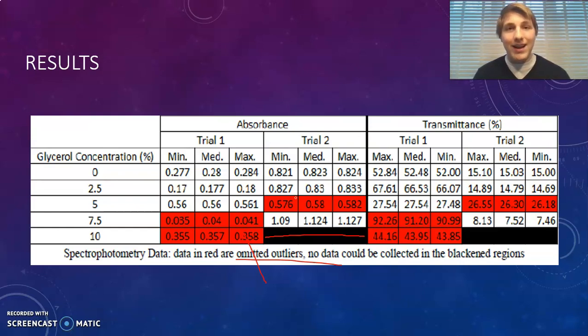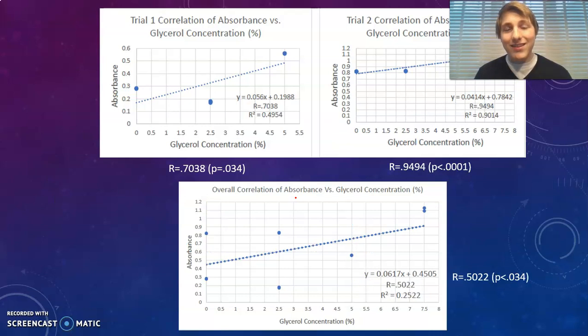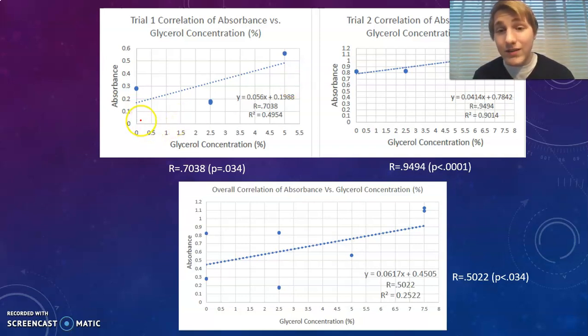I loaded it in, I had a counterbalance, I had everything properly in there, but the centrifuge was faulty and the tube was just torn up inside of it. So I suppose that's just what happens in a lab. But I did get some good data here. I did get some salvageable, really good data, actually.